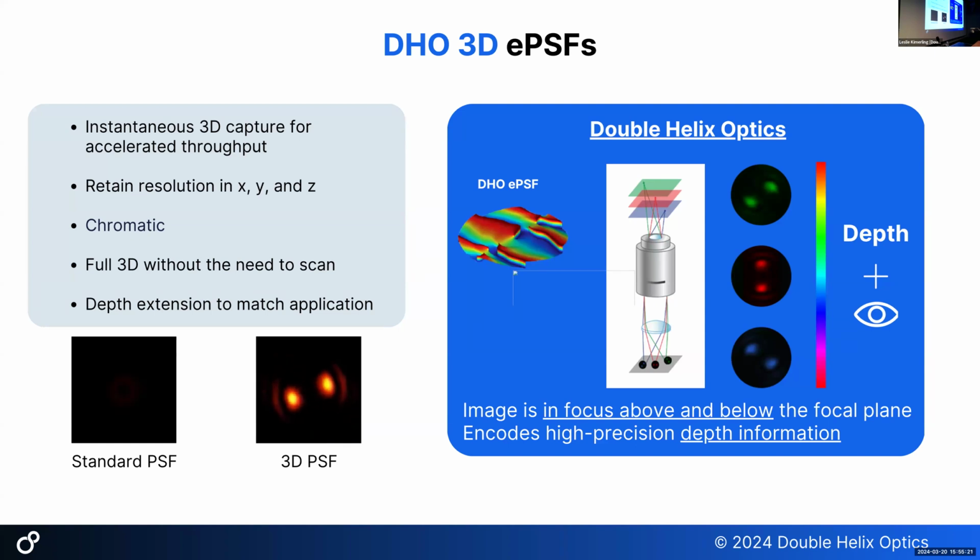So I think all the images you've shown were stained or tagged molecules, is that right? Is there sufficient contrast enhancement to go to unstained or unlabeled cellular structures? Label free. We've worked mostly with fluorescence, some sort of tag. Whatever they want, quantum dots. It doesn't really matter. For us, it's just a source of light, something that says I'm here, so we can find you, right? I was just going to say, we haven't really worked in the label-free environment, but for inspection, for example, it doesn't need to be tagged, right? Because you're getting light. Yeah.